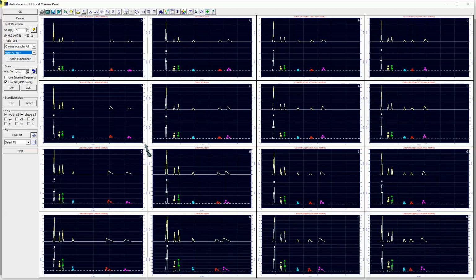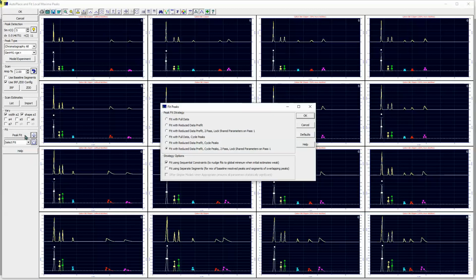With 6 peaks detected in each of the data sets with the current settings, we begin the fitting using the most advanced of PeakLab's fitting strategies. Each peak will always fit a separate area and location. Here we also fit separate widths, separate chromatographic distortions. Only the third moment peak asymmetry, which is A4 in this model, and the 3 parameters of the IRF, which are A5 to A7, are actually shared across all of the peaks.